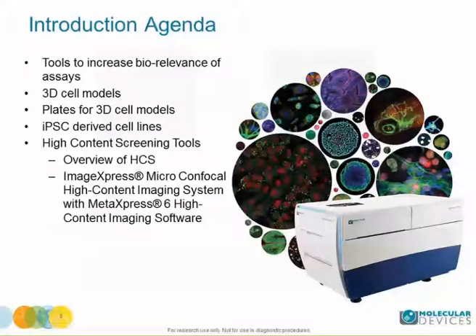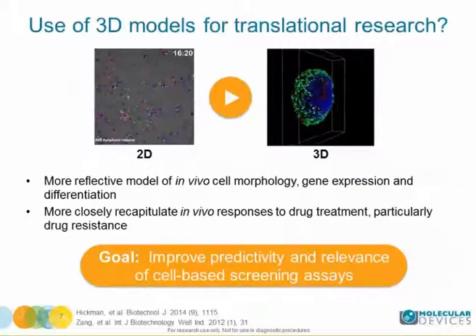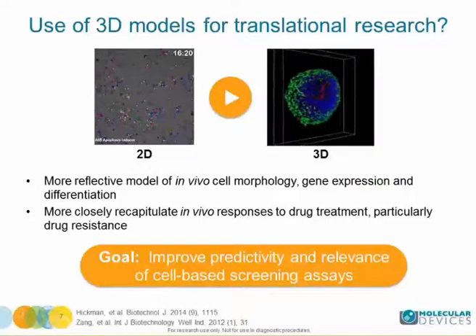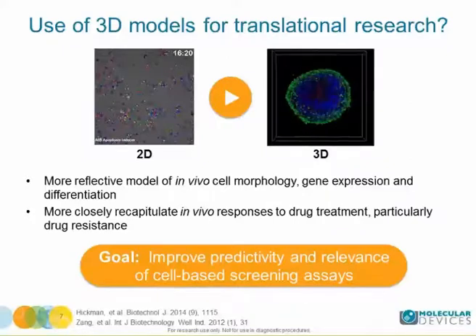So the use of 3D models is expanding. It's quite hot right now. People are trying to use it for translational research. People have been doing 2D assays for quite a long time, and there's this transition to 3D assays.